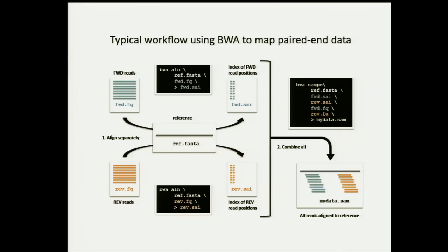That's the short read aligner. There's also the long read aligner if your reads are longer than the spec says, 200, but I've got good results with 150 base pair or longer reads. You go to the long aligner, which is just BWA SW instead of align. And the command line is very simple. It's just the reference and your FASTQ file. And the output will be this SAI file.